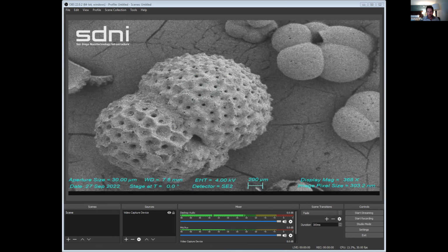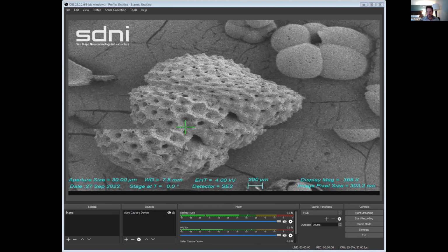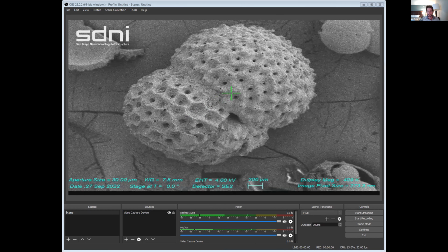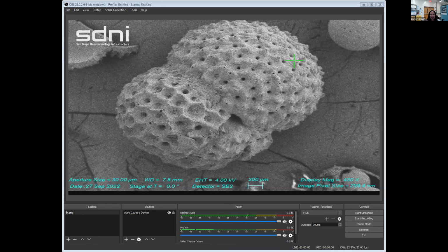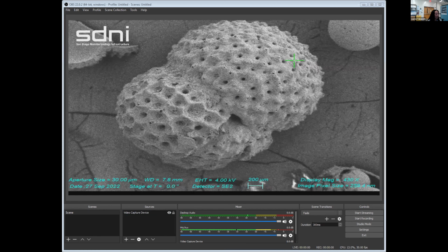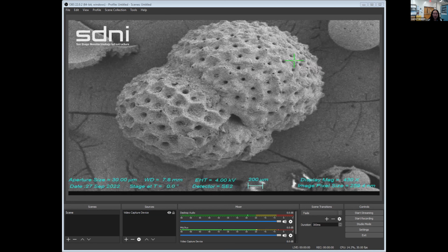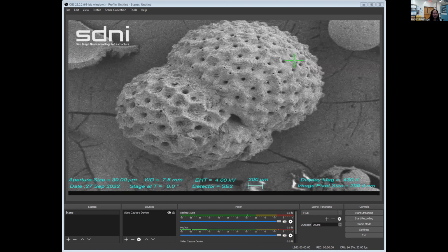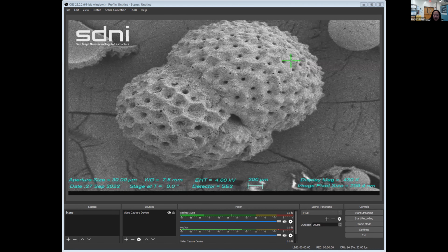So Lauren, quick question that came up here. Which of these things you're doing would a student be able to do remotely? So actually all of these things, there's only a couple controls, so these can all be done remotely. Like zooming in, moving, focusing on an image.